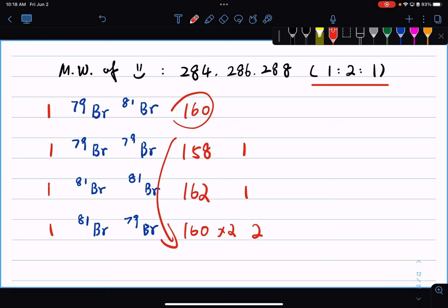All right? So from here, what we derive is our molecule contains 2 bromine. Yes? So I think I had the right thought process. I forgot that the isotopes were counted. Right, you're doing 4 instead of, because I was just thinking chlorine. No, but that's a good lead, right? You're looking at that distribution, and when you have more than 2 peaks on your molecular ion, just think about it. Where do those more than 2 peaks come from? It's a combination of different isotopes together. All right, so that's our first step.